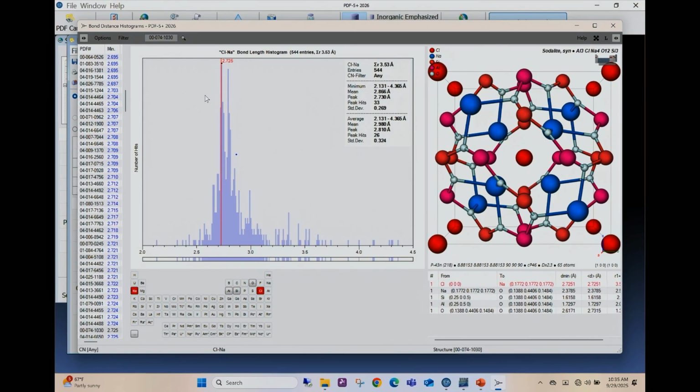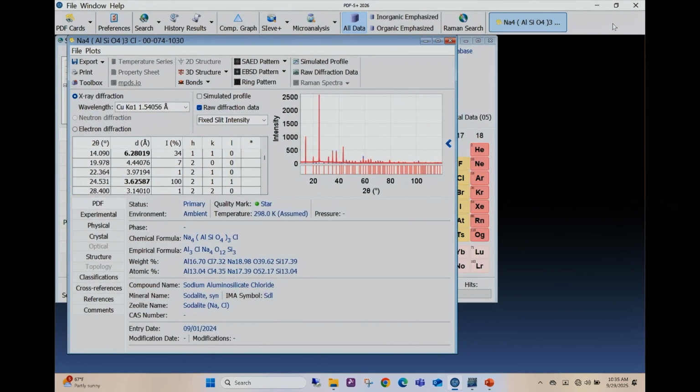Again, sometimes when people are doing some structural work, they just like to get a sense, does this make sense or not for this kind of bond? Maybe not as unusual in inorganics, but in organics it's quite a bit. Someone says the bond length is unusual. The bond angle is unusual. Okay. But our focus here is on the inorganic materials in this case.